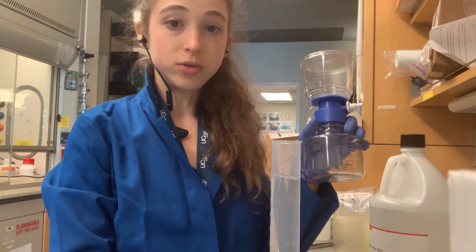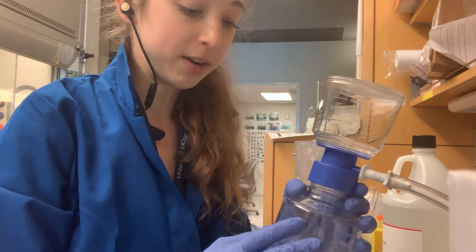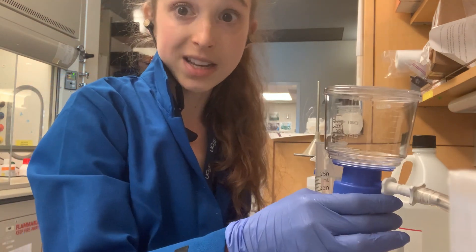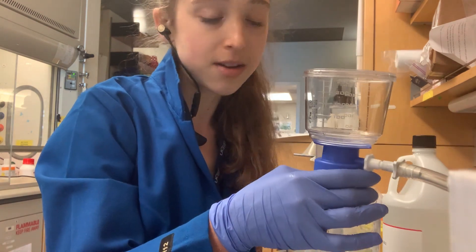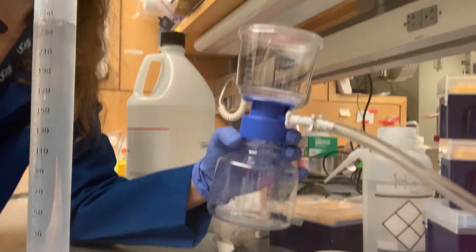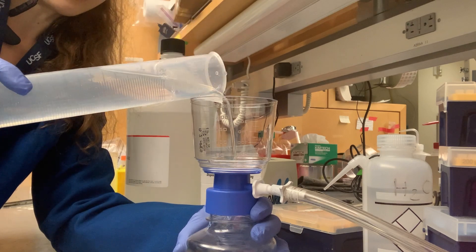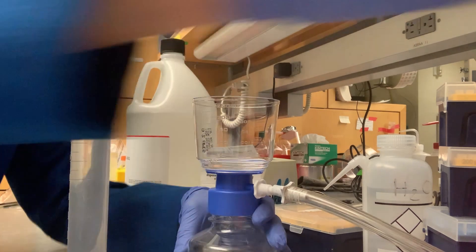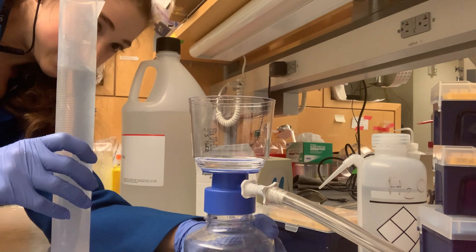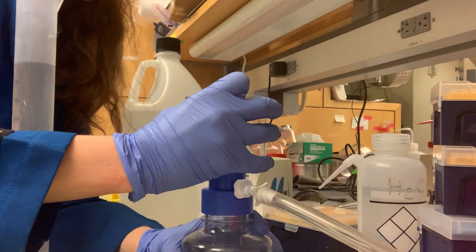Once it's mixed, you'll want to filter it. I use a vacuum filter — just a 0.2 micron filter, which is really good for getting rid of little buggy stuff. The reason we want to filter is that glycerol is a sugary substance and microbes like bacteria can feed on it and grow in it, so we want to remove them. These vacuum filters are easy to use — just make sure it's screwed on tight, pour in your solution, and turn on the vacuum line. It should start sucking through, though it might take a while because the glycerol is viscous.